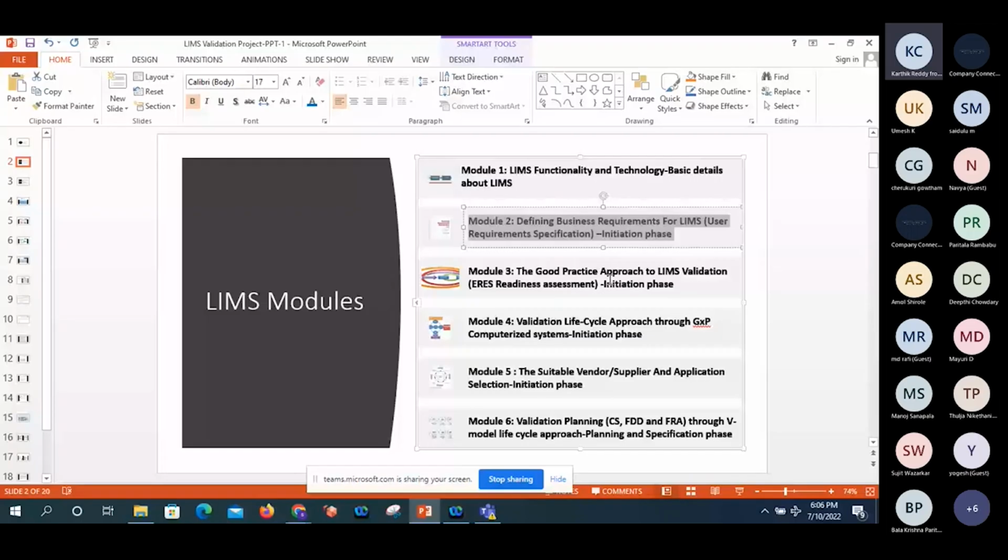After that, a change control can be raised by any organization, like pharmaceutical companies. After that, there is planning. Validation planning is there. Under the planning phase, there is a validation plan. Under that, the deliverables in the specification phase are the functional specification, functional configuration specification, and functional design document. Then coming to the design specification, we do configuration testing against our URS, the user requirement specification. If anything is identified, we write it as a gap assessment, and those things are shared with the vendor for their configuration.